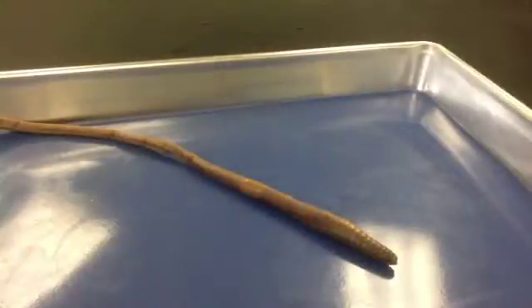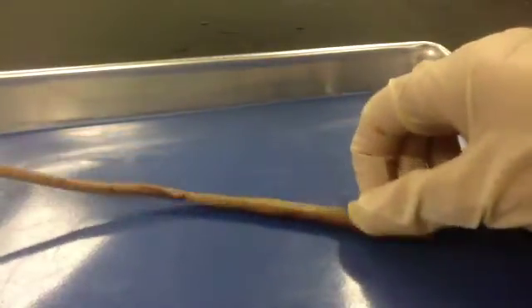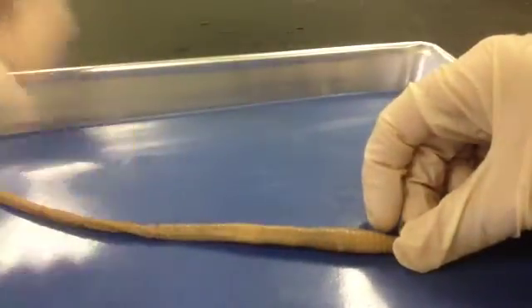The first thing we want to do is identify the dorsal versus the ventral side. Ventral is your bottom or stomach side, and on the earthworm that's going to be flattened and a little bit lighter. So it's a little bit hard to tell, but here we can see this is our ventral side and this is our dorsal side. So let's look at the ventral side first.